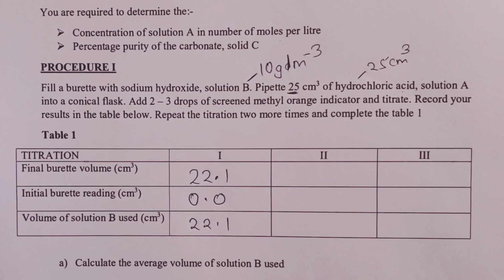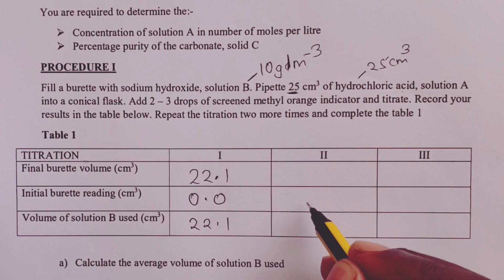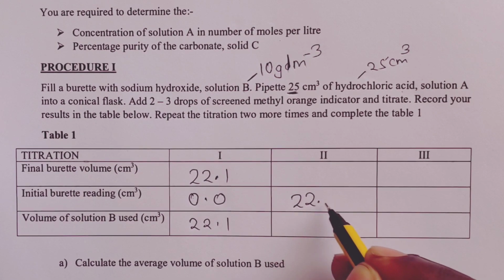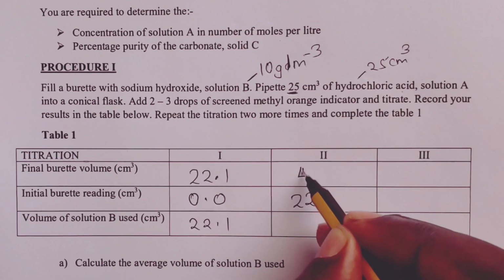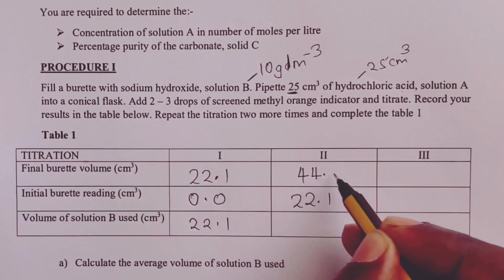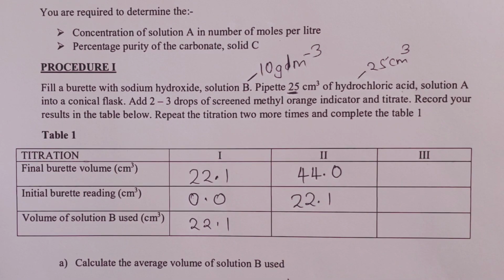For titration 2, because we did not want to waste time, our initial was the final for titration 1. When we were through with the titration, the final burette reading was 44.0. If we do the subtraction, we get volume of B used as 21.9 cubic centimeters.